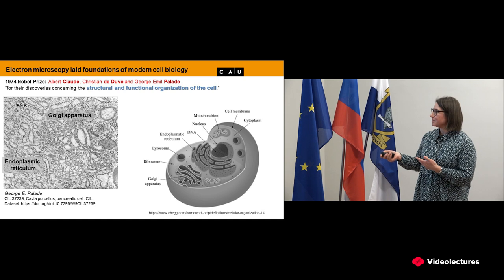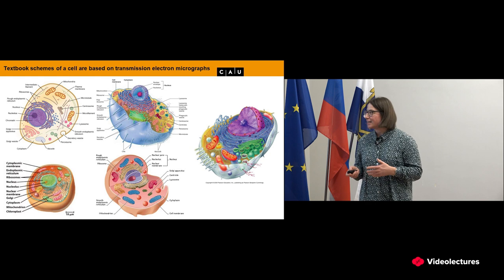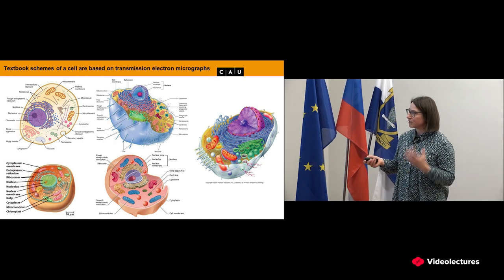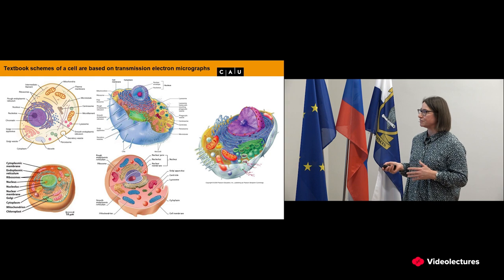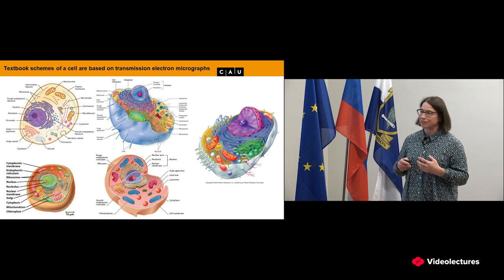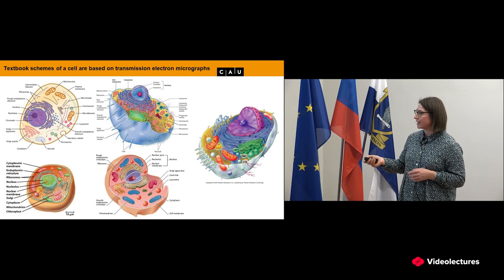Schemes of cells that we see here are all based on transmission electron micrographs. Yeah? But often I think, especially students, forget about this. So I think it's important to know the origin, how the original images look, because this is very colorful, now 3D, but I can tell you, when I studied them a little bit more carefully, the more colorful and fancier they are, often there are many mistakes in them. For example, we know there's not just one or two ribosomes. The cytoplasm is packed with ribosomes and other organelles and proteins, not like empty spaces.